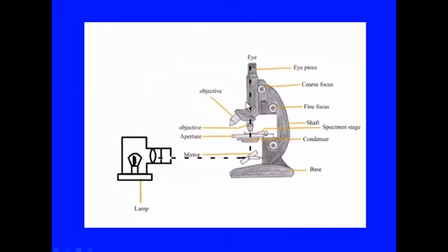Now, we will discuss, like there is a coarse focus, there is fine focus, and you can adjust the microscope accordingly for focusing onto the specimen. Now, let us move on to the two optical systems. In the fixed tube length, remember, the fixed tube length is around 160 millimeter, as widely accepted.